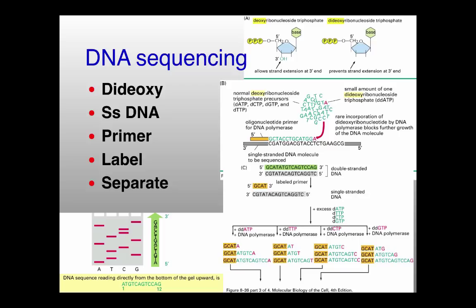So now I want to talk about probably the most important topic of this whole course, which is DNA sequencing. This is the original DNA sequencing, which was used to determine the sequence of a particular DNA. We already mentioned one of the breakthroughs that was really important for this, and that was these polyacrylamide gels, which have resolution of individual bases relative to each other. So this piece is, in this case, one nucleotide long, this one's two nucleotides, three, four, five, six nucleotides, etc.